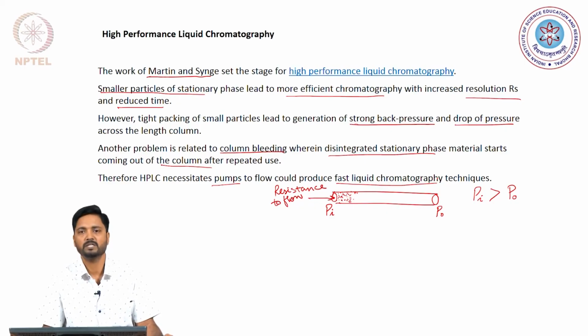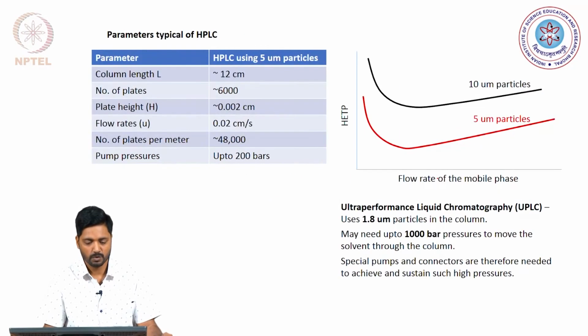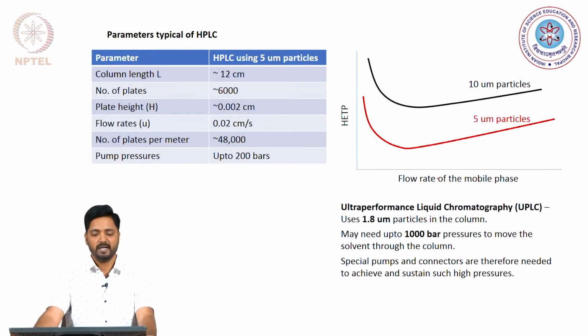Based on the particle size being used in the chromatography column, the pump performance has to be carefully chosen.